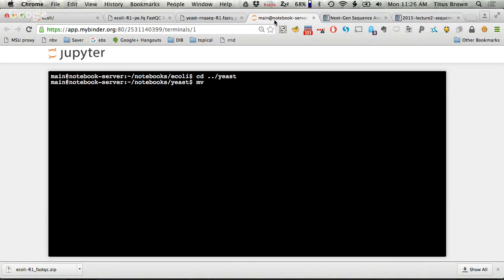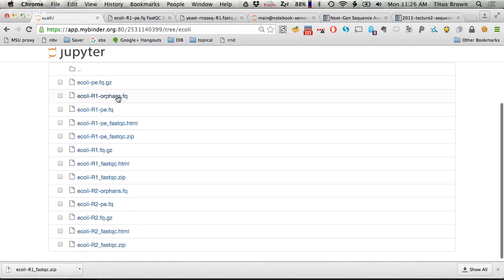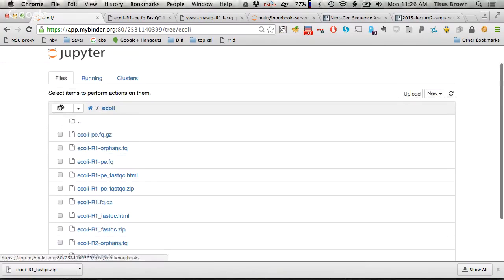Yeah, I can move it from this family. Fine. Okay, so what I just did there was I moved the file from the neighboring E. coli folder to the current directory, which is what the dot did. I'm going to do dot rnaseq.sh. Actually, you know what I'm going to do first? Now it's been moved, so I have to go find it.